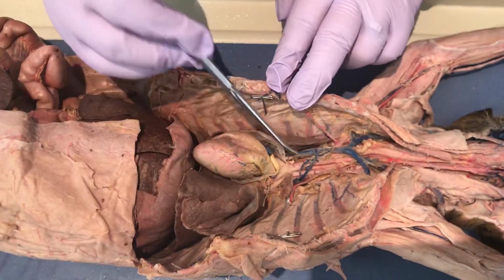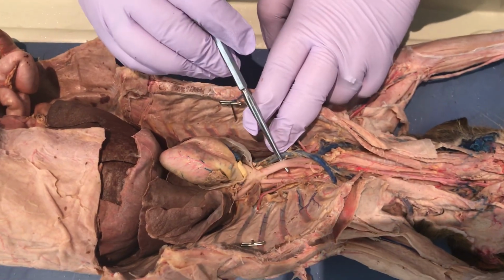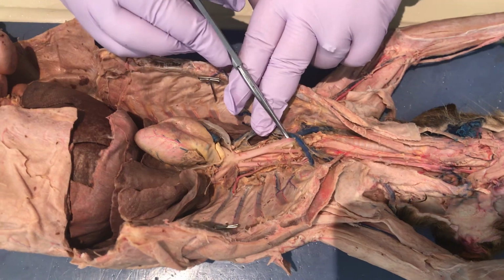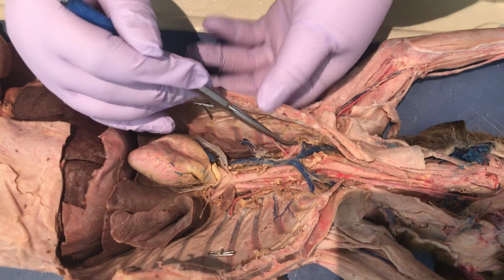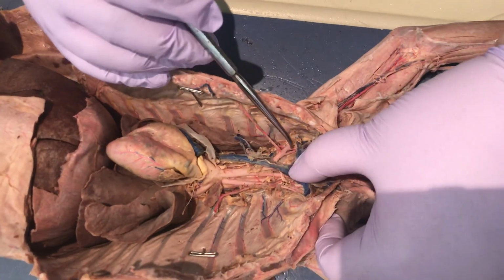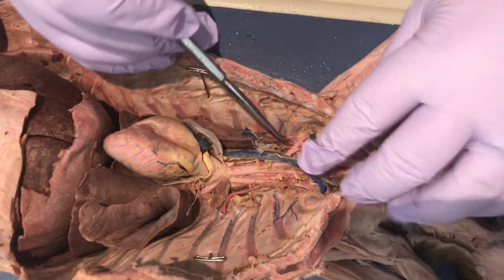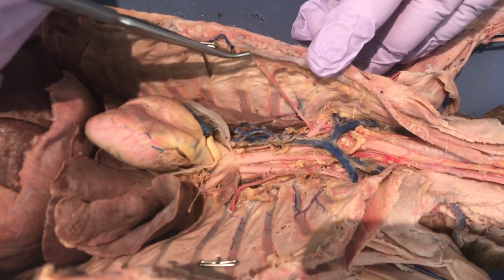Okay, back up to the top. The first branch off the aorta is the brachiocephalic artery. The brachiocephalic artery is going to branch into the left common carotid, the right common carotid, and this one over here is the subclavian artery. Off the subclavian artery, we have little tiny arteries. We have the vertebral artery, the costocervical artery, the thyrocervical artery, and this internal mammary artery headed towards the chest.